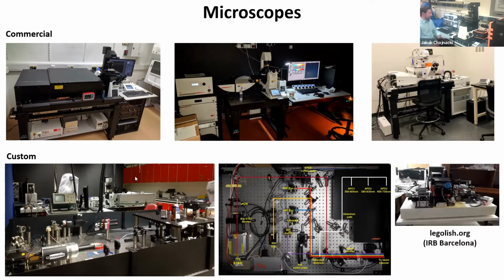And there are also projects which actually utilize Legos to build your own microscopes. If any of you is interested, here at IRB in Barcelona, on this webpage, there is an example of a project which allows you to build your own quite powerful and useful microscope utilizing common elements from Legos. So if you're interested in setting up your own project and building your own microscopes from Legos, there is this project, and there are a couple of others on the internet, which allow you to build quite powerful microscopes, so you can test all those things yourselves.